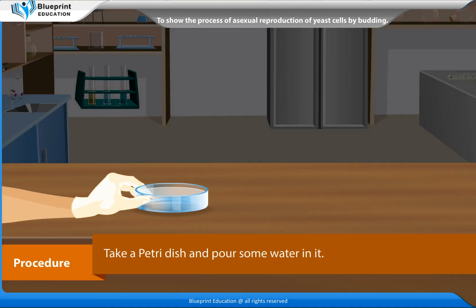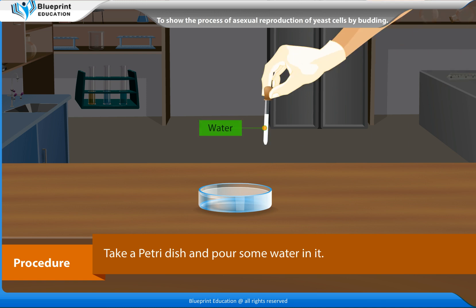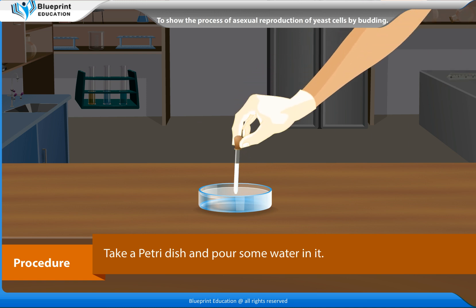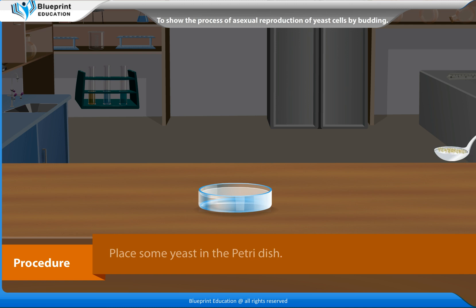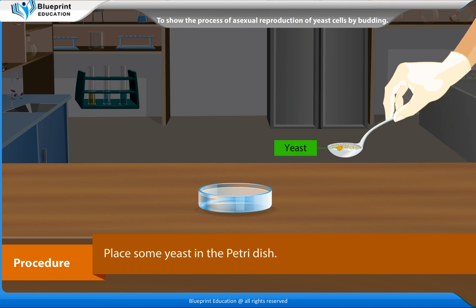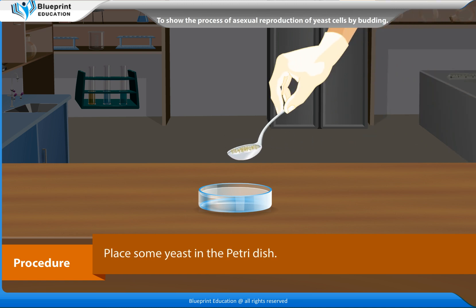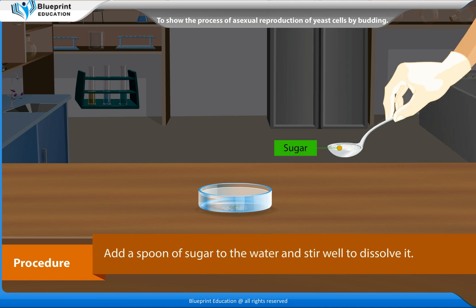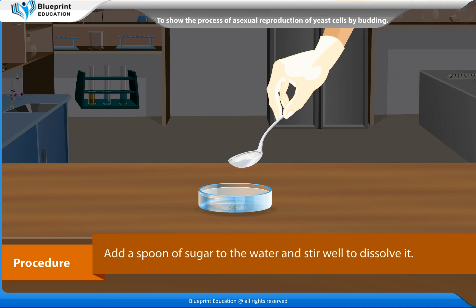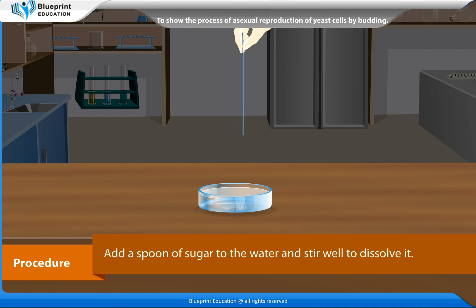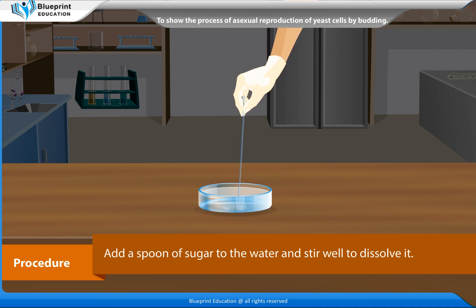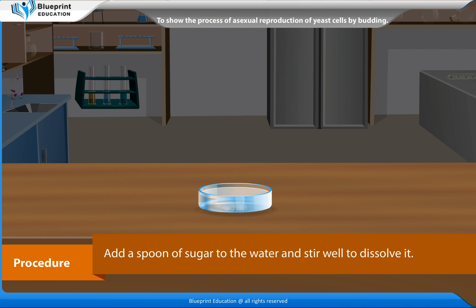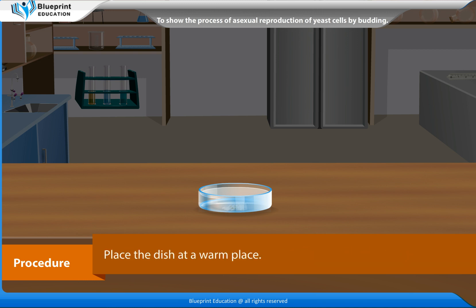Procedure: Take a petri dish and pour some water in it. Place some yeast in the petri dish. Add a spoon of sugar to the water and stir well to dissolve it. Place the dish at a warm place.